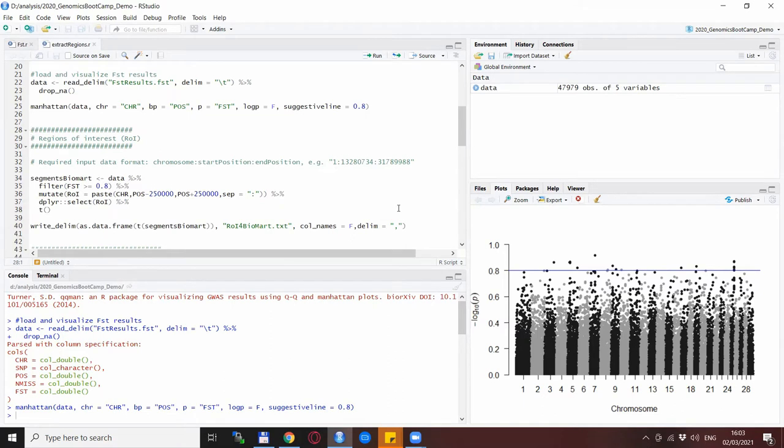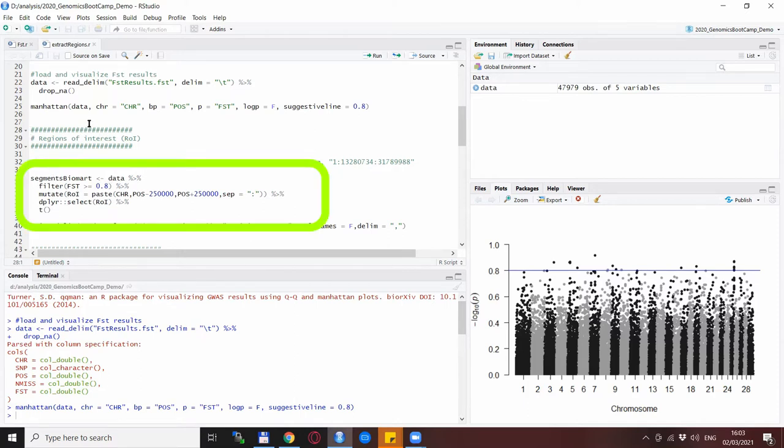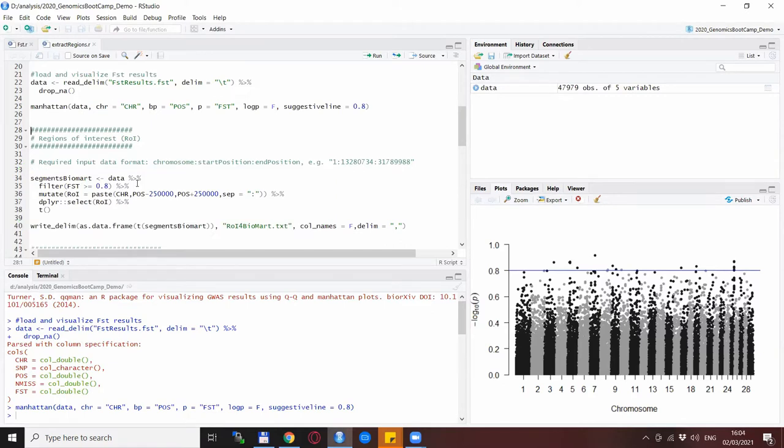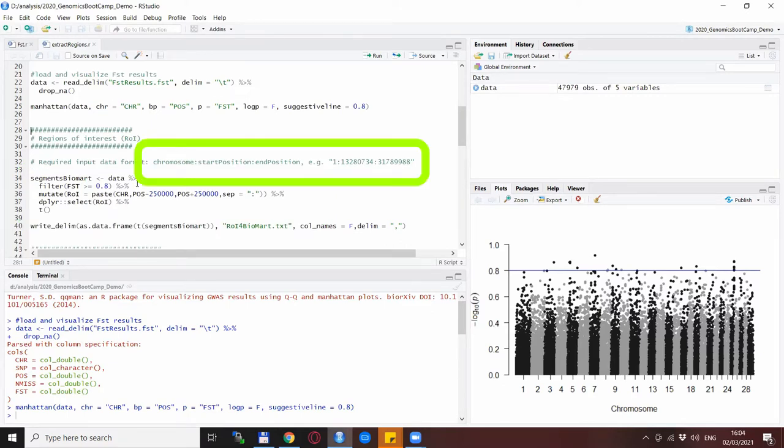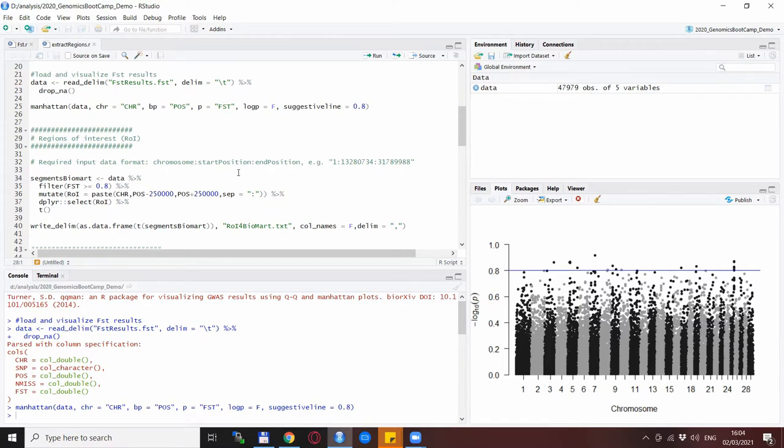The first thing we want to do is to extract these regions and the package that we will be using is called Biomart. So we loaded the FST data and we filter it so the FST values we keep are higher than 0.8 and then specifying a region of interest. Because of the requirements of the Biomart software we need to specify each region as chromosome starting position and end position divided by colons. So it's as it's written here: chromosome, start position, end position.